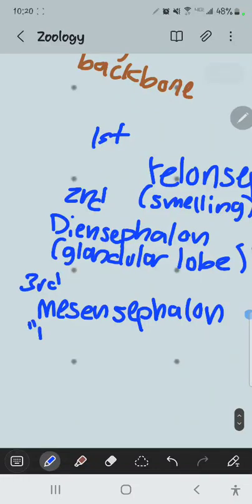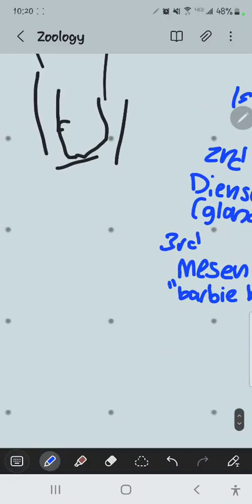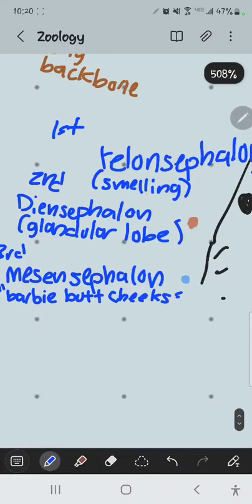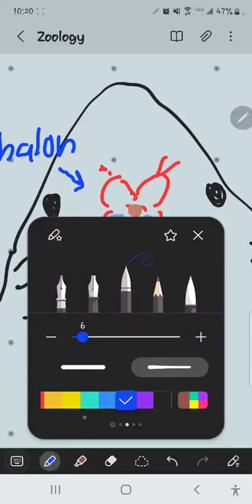And so that is the optic lobe. And what you'll see is that it actually has nerves that radiate out to the eyes. There's a really interesting feature. You won't see it unless you go in from the ventral side. Some of those from the right lobe go to the right eye and some go to the left eye. But there are crossing nerves also, where the right lobe has a left cross and the left lobe has a right cross.